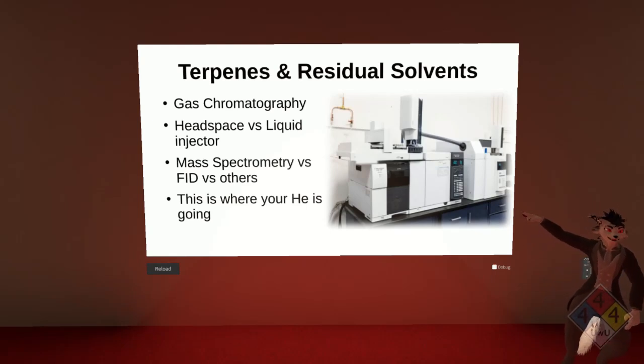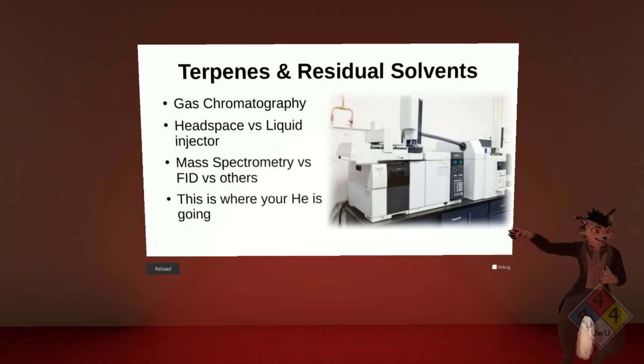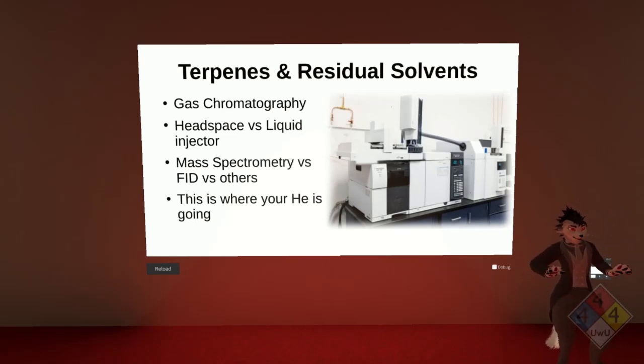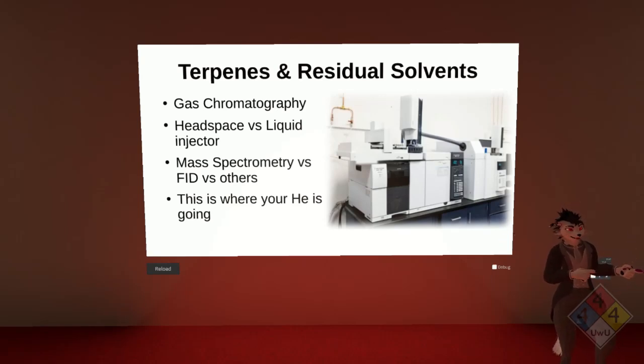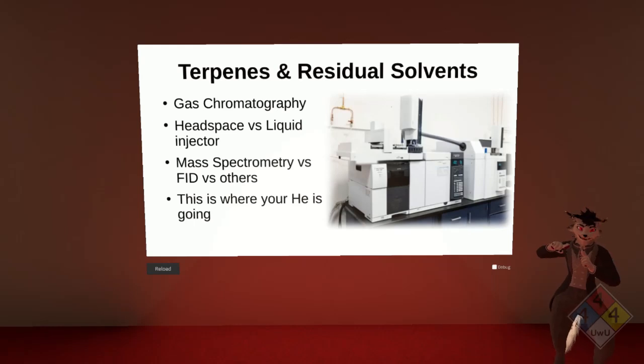And multiple of these systems use mass spectrometers. So in modern chemistry, knowledge of mass spectrometry, I think, is pretty critical in anything in terms of quality assurance or quality or analytical chemistry of any type. FIDs, though, are workhorses, and they're found very commonly because they're cheaper, and they definitely have their advantages. And when they work, you want to use an FID. But a lot of stuff is mass spectrometers now. There's a lot of other detectors, like we were talking about. There's spectroscopy type detectors, but there's also things like ECDs, electron capture detectors, and other things that have some advantages and disadvantages. But a lot of the field in chemistry has condensed into mass spectrometry and FID.